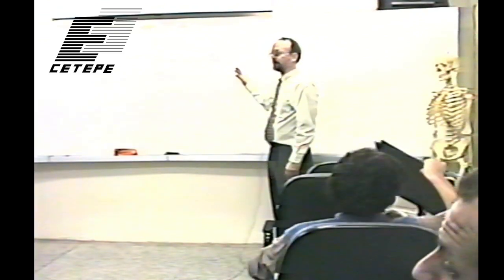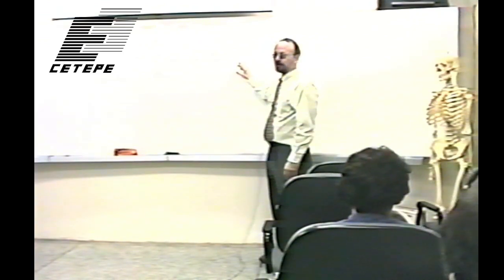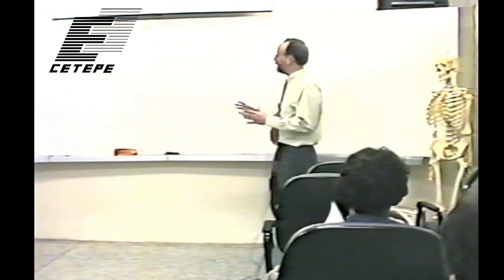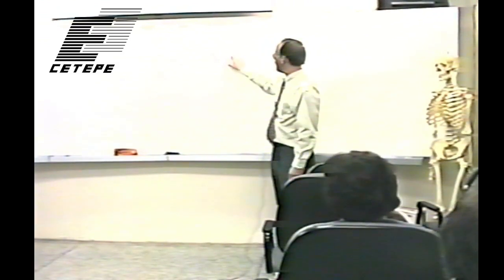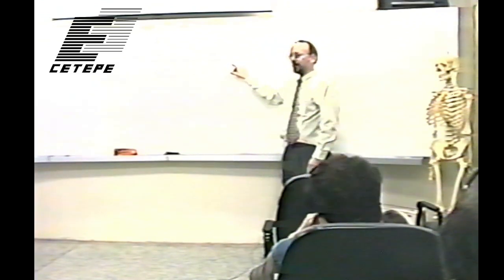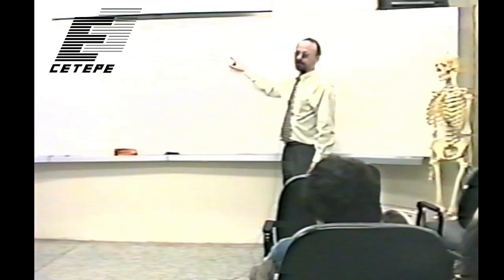But more and more commonly today, this output light is taken by what's called a tandem optics system. So tandem means 2. And so that means you have 2 lenses usually, or 2 sets of lenses. One set here I've tried to indicate is called a collimating lens. And this lens is focused on the output side to infinity.